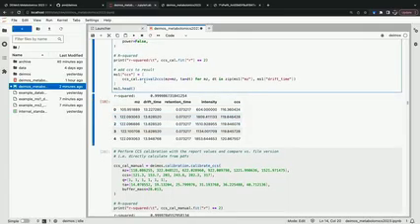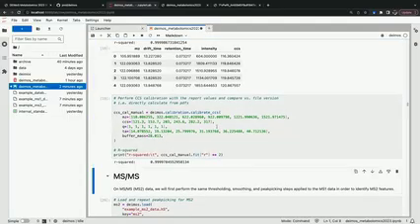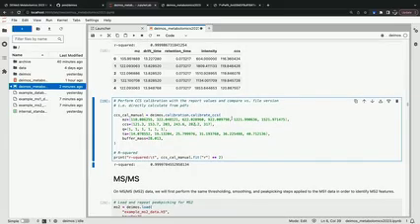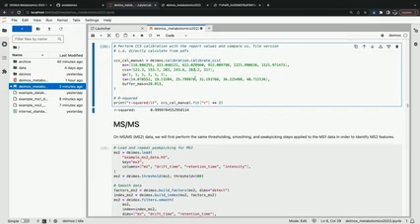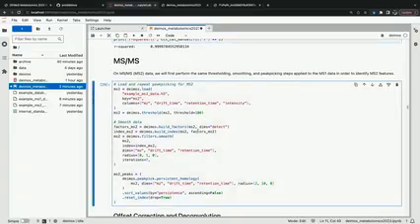And so I've done that here to add our CCS to our original data. There's also this manual calibration, like I mentioned before, that's just done through this DEIMoS calibration.calibrate CCS. And again, you can feed in that list of expected ions and known CCS, and it'll save those calibration parameters as well, and you can apply those as needed. But here, since we have a tune file, I'm not going to apply that to our data.